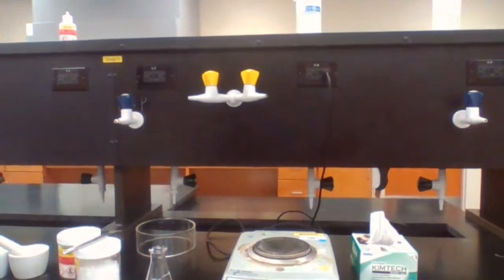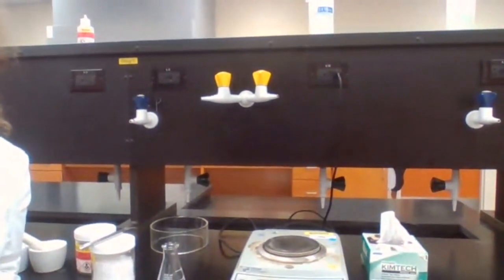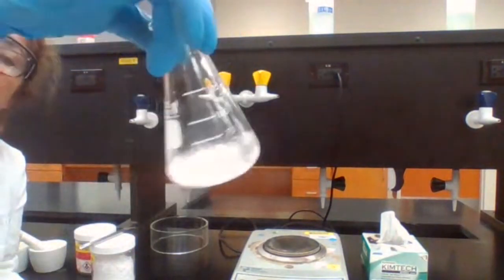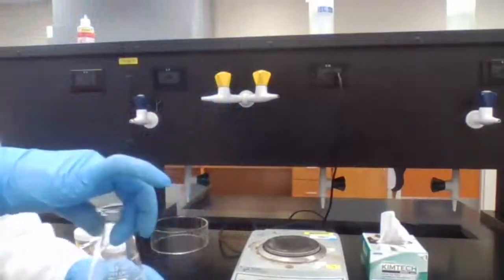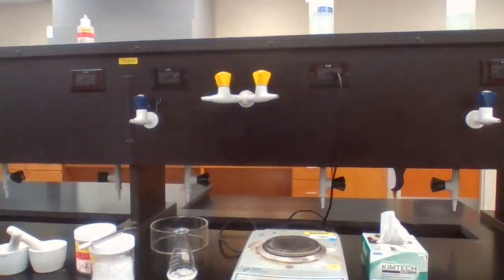in IR. That was the anhydrous calcium chloride that would absorb the moisture. They are moving around now. And since they are moving around, that means we have enough of the calcium chloride. I don't have to add any more. So I'm going to bring a beaker and get the mass of the empty beaker.